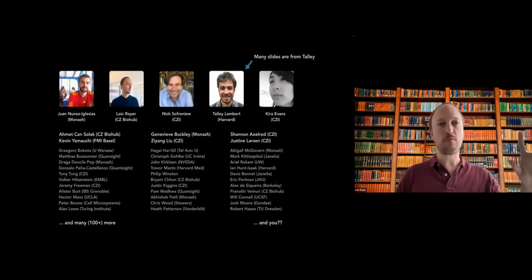But now the current situation is we have people like Talley Lambert, who in the past year and a half has contributed amazingly, and has put a lot of work into this project. And we have many contributors, and it's impossible to mention them all by name, but here's the list. We have more than 10 core developers now, I think, and it's increasing regularly, and we have more than 100 contributors all over the world.